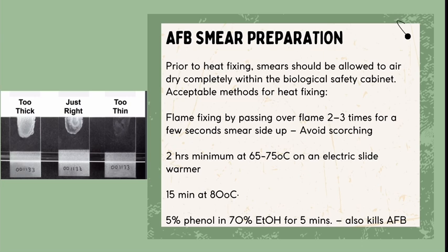So you have examples here of the sputum smear that is being too thick, and on the right portion we have a smear that is being too thin. So the one in the center is the right amount of the sputum, not too thick and not too thin.